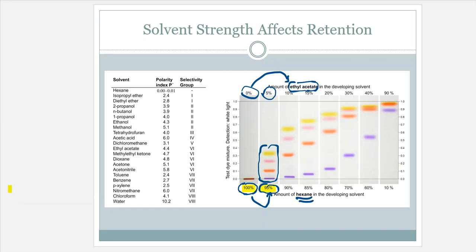It showed me an orange band and a pink band and a yellow band. So there's multiple components there, and it did separate some of these. Right now, did it separate all of them fully to the best of its capability? No. But look at what 5% changes did. So when we change our mobile phases and our developing solvents for TLC and HPTLC development, we are going to be baby stepping. That's what we're going to be doing in these changes.